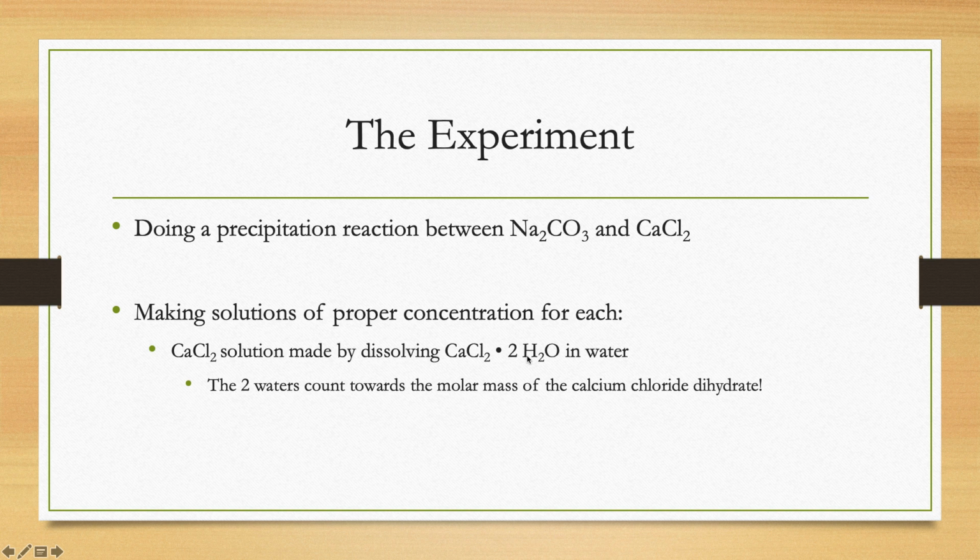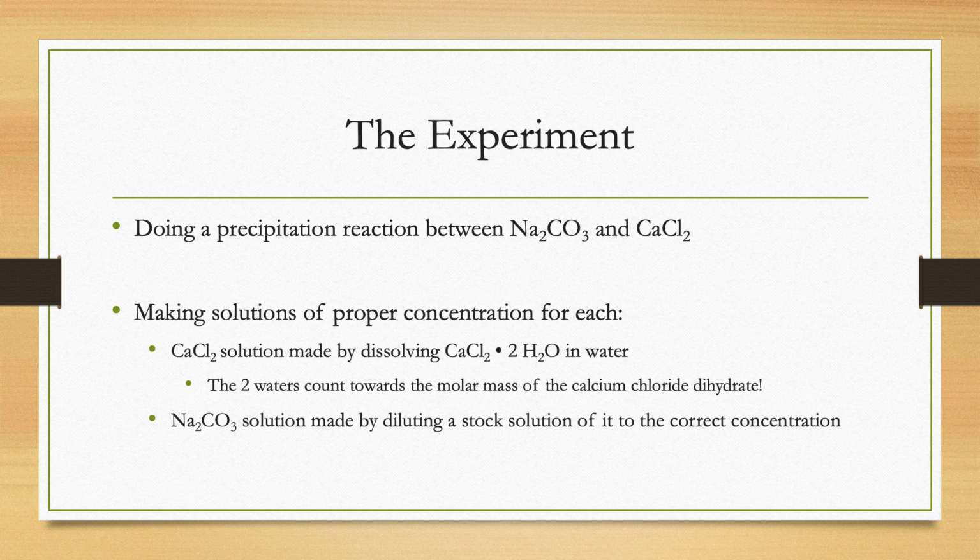This is for those chemical compounds that, when they solidify, actually trap water in the solid in a proportional amount, like a whole molar amount. And so for this compound, when you calculate the molar mass of this solid to figure out how to make the solution, do keep the waters as part of its formula to find its molar mass. That is important, or else you will make a different concentration for your particular compound. So keep that in mind for your concentration.